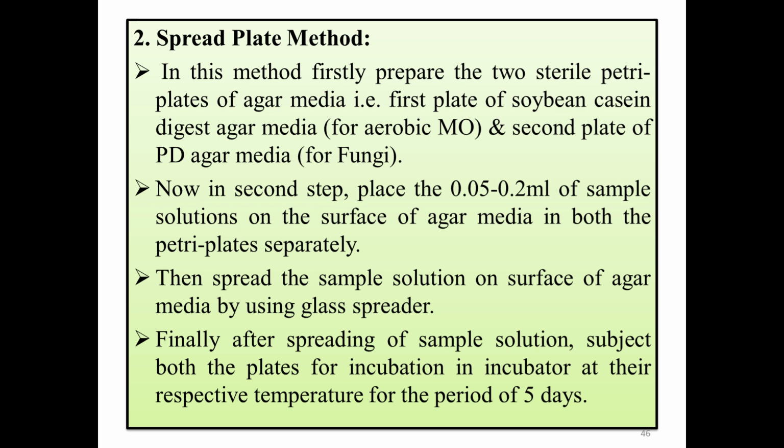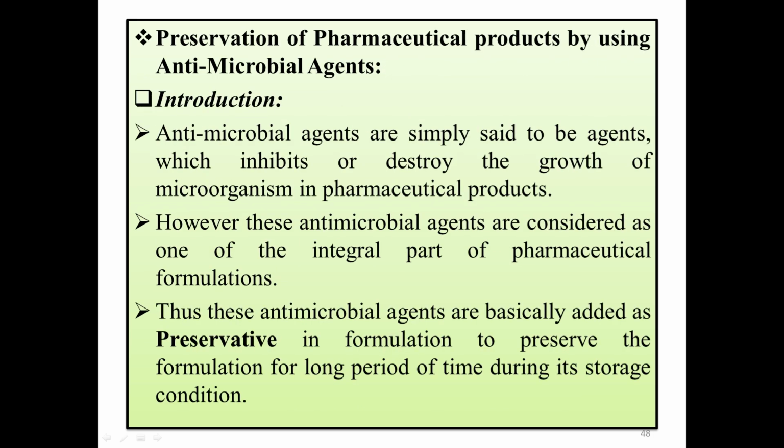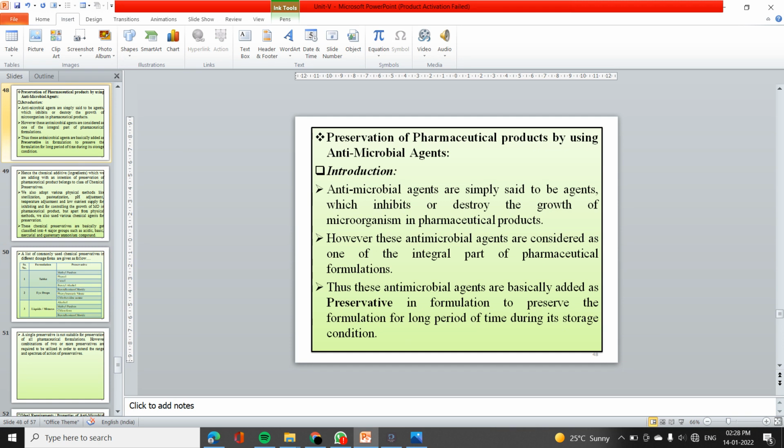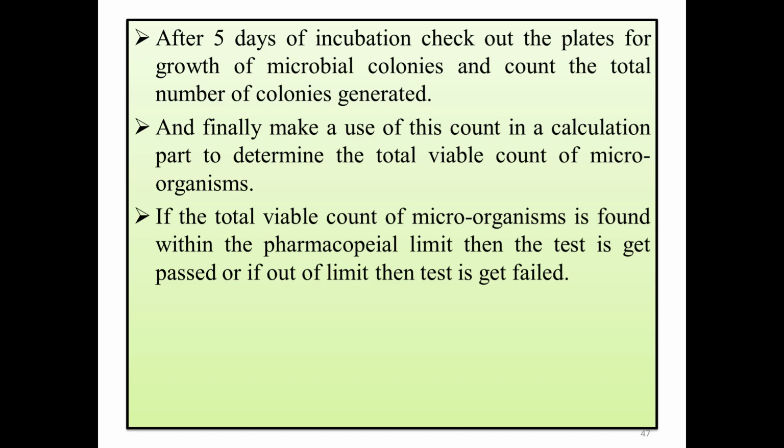To make the growth of microorganisms we use an incubator, and in this incubator the samples, these agar media or nutrient media will be placed. Then after 5 days of incubation we'll check the plates for microbial growth or microbial colony formation.